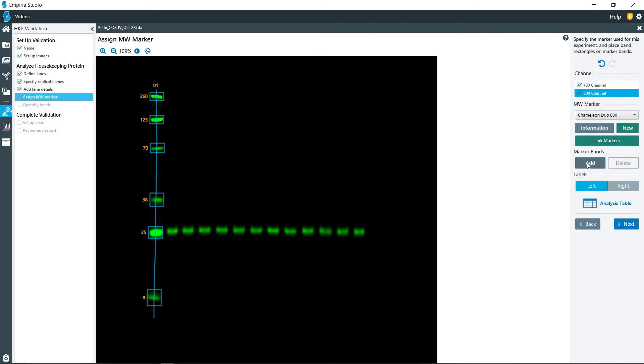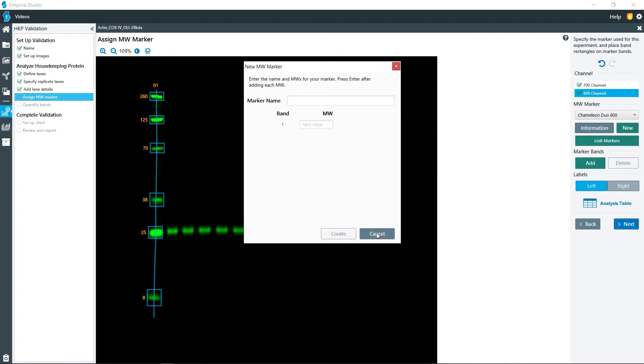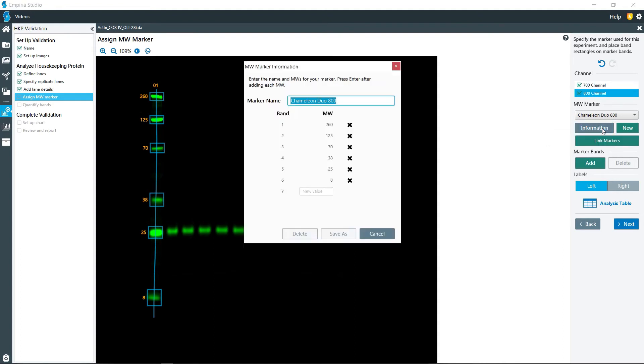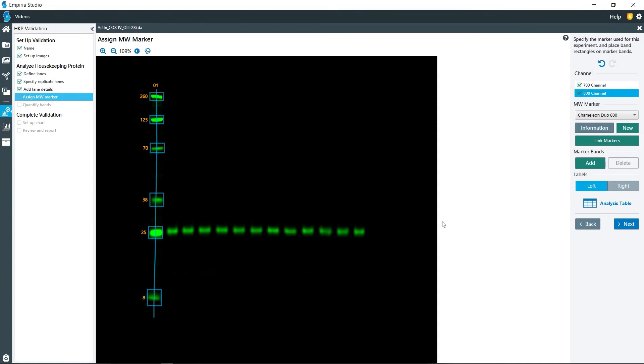And then done. So if you have a different molecular weight marker that is not from LI-COR, you can click on new and add all of the molecular weights from that particular marker. Or you can also click on information, and you can delete values on here if you would like. You know, let's say for instance the 260 kilodalton was not resolved and you're not seeing it. You can remove that and then save that as a new marker for later use.